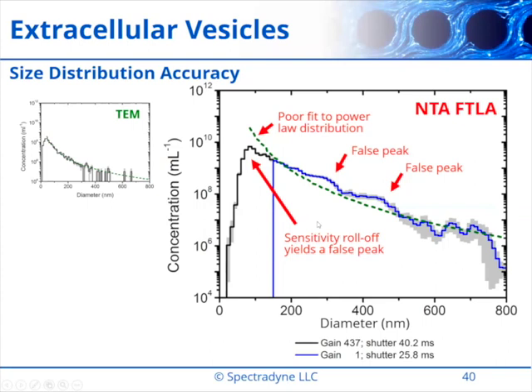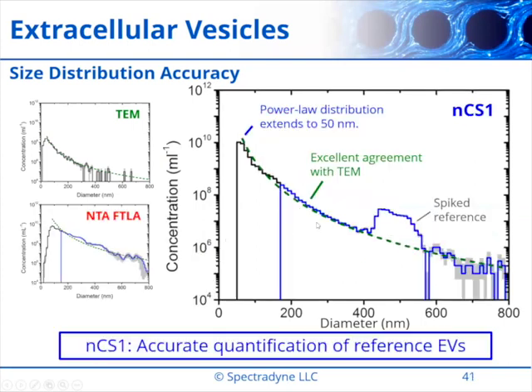All right. Now, if we look at the NCS1 data and compare it to this distribution derived from TEM, we see excellent agreement basically between the 2 distributions. Our measurement is, again, 2 cartridges, so a larger cartridge in blue, a smaller in black. In this case, we spiked in our control beads, again, to just have a nice in-measurement control. I don't want to dwell on that too much. However, I do want to point out that this is a pretty powerful thing to be able to do.